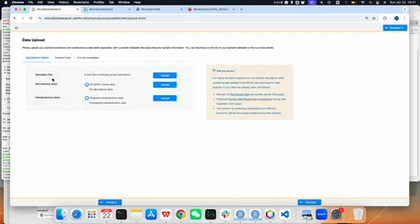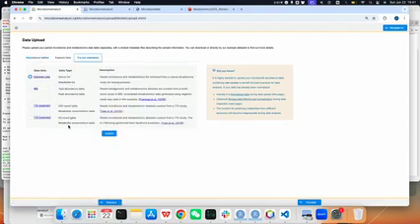First, the metadata. This is the shared one for both omics data. Then for microbiome data, we accept either OTU or ASV count data, or we also accept the result from shotgun metagenome data, which can be a KO abundance table, but we don't demo it here. If you are interested, you can try our example. You can see we list different types of data here. You can try any one you are interested in to see the difference.